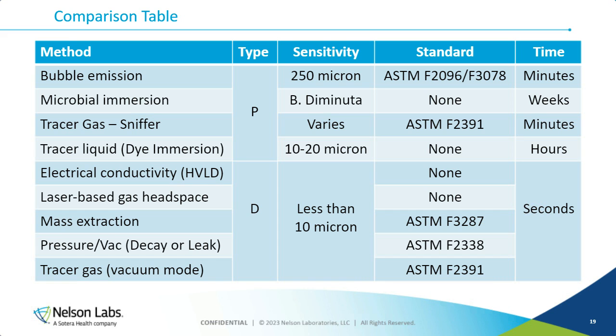As far as standards go, I have some methods with and some methods without standards in both categories. I would suspect that in the future we will see standards for electrical conductivity and laser-based gas headspace.